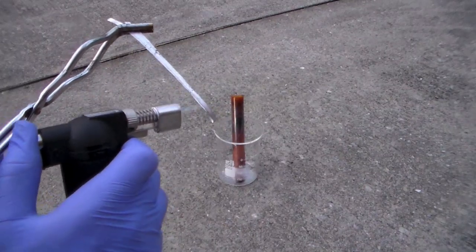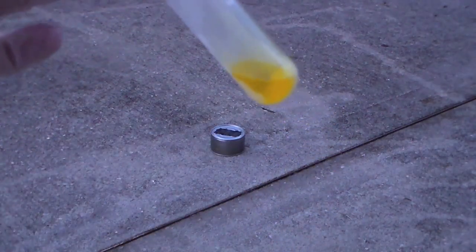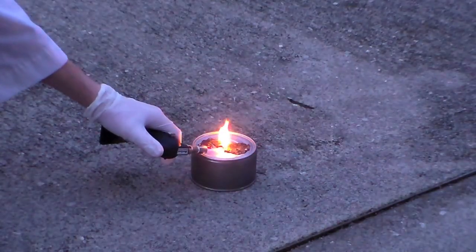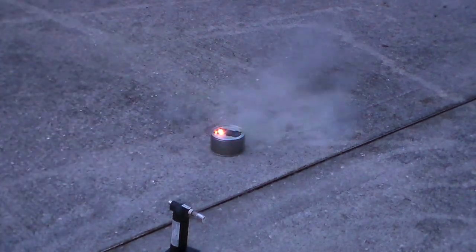Here's the original audio so that you can hear what the reaction sounded like. Next I decided to try reacting the liquid chlorine with lithium, which is even more reactive than magnesium. I lit the lithium on fire and then poured liquid chlorine on top of it.